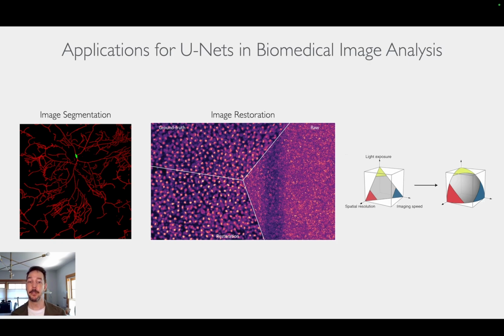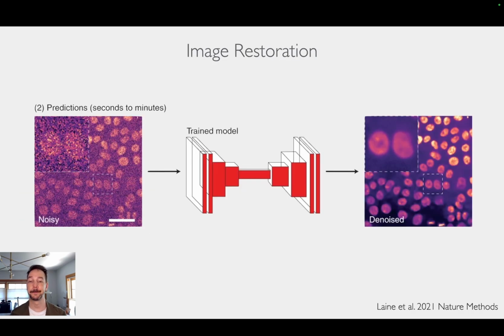There used to be, and there still is, a trade-off between image resolution, signal and speed, but we can really stretch those boundaries. Now we can image a lot faster without compromising our ability to see cells or endosomes. I think this is really a watershed moment in what's possible using microscopy, and I hope that the techniques you learn during these workshops can help you think outside what you thought was previously impossible and do exciting research.